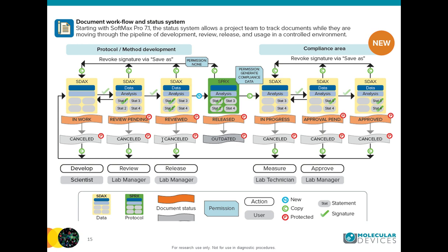Great, thank you. All right, your next question is, what about the backup and restoration of SQL database? So for the single computer setup, we do provide a tool to back up the SQL Express database. For the larger versions like SQL Standard, the IT departments typically already have set up a backup system because we are not the only ones using SQL databases. They're fairly standard, and typically the IT department already has set up a backup tool.